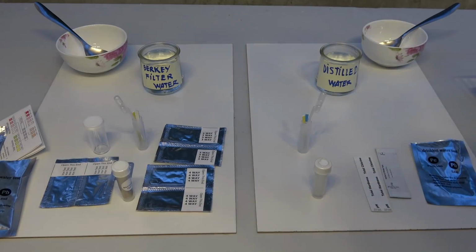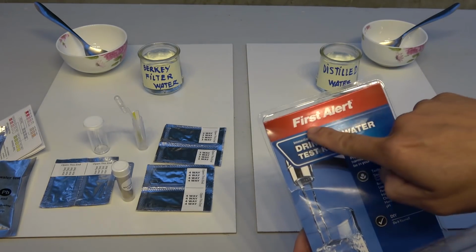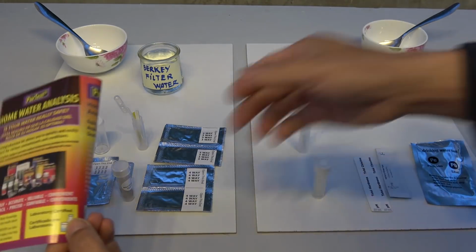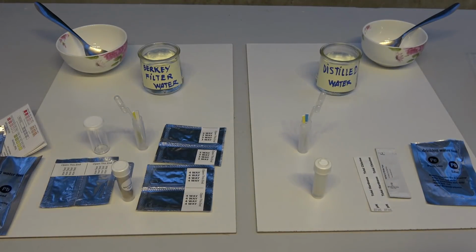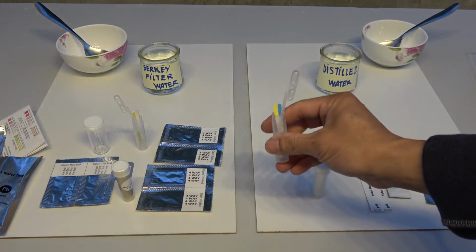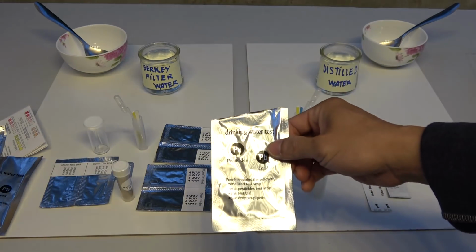Right, so here is the inside of the packages. On the right side, we've got the First Alert. On the left side, it's made by Purtest. Even though they are different brands, the test materials are very similar, especially the lead and pesticide test strips here. The lead and pesticide strips are identical in both test kits.